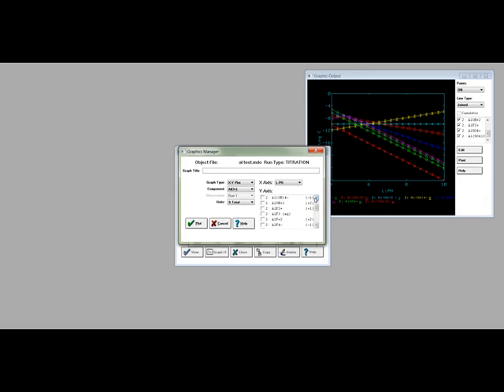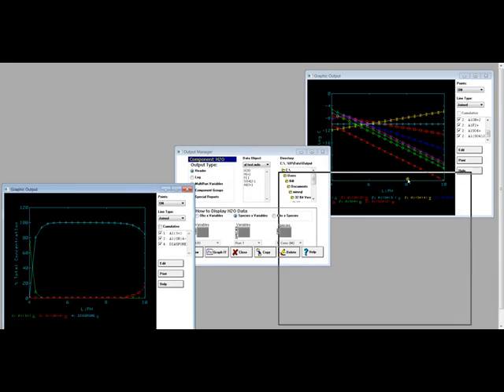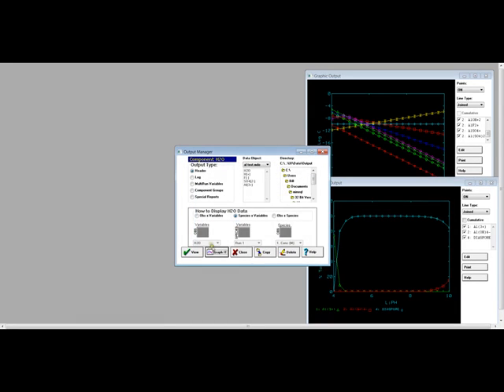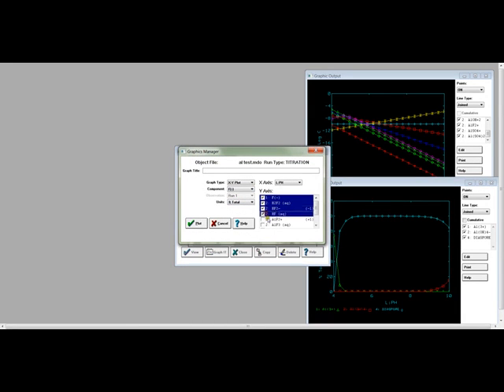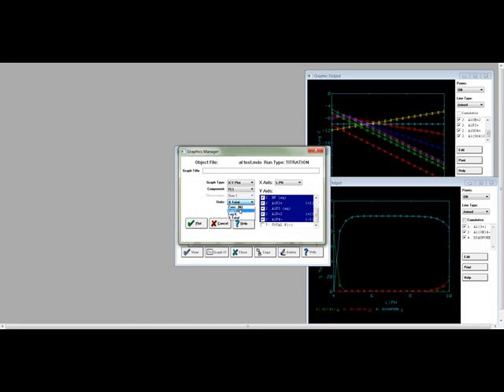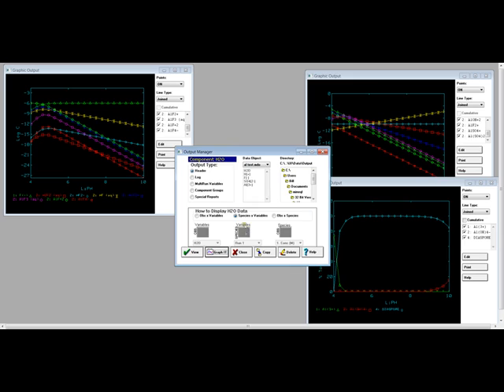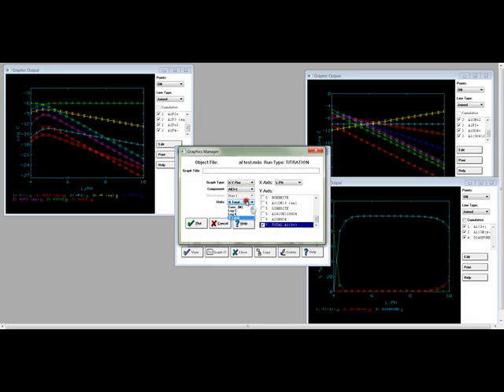You can go to the output manager and see the chemical speciation for the entire range using tables or graphs of all types. Have fun!